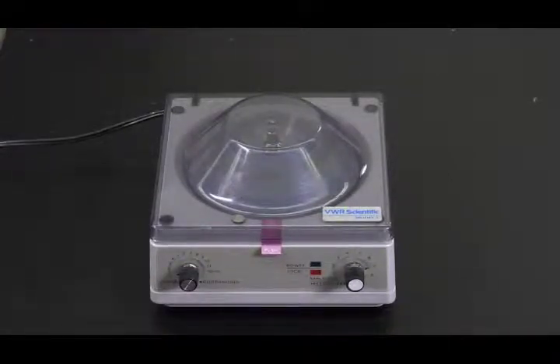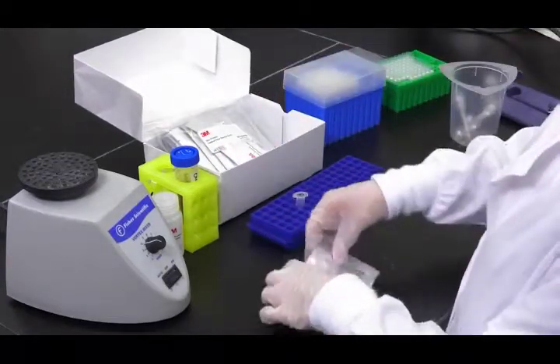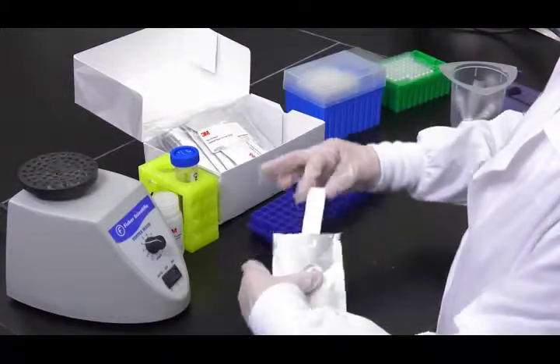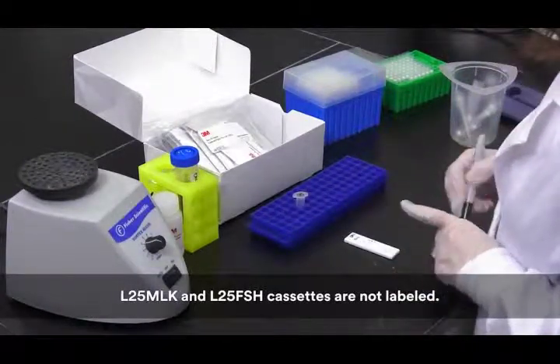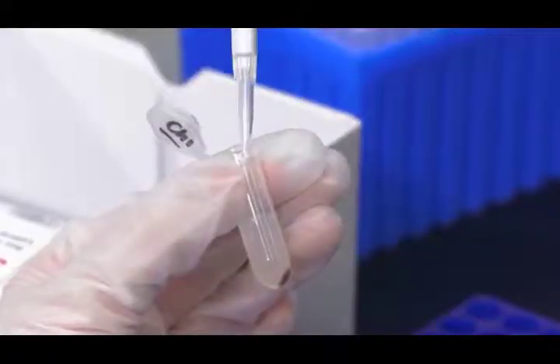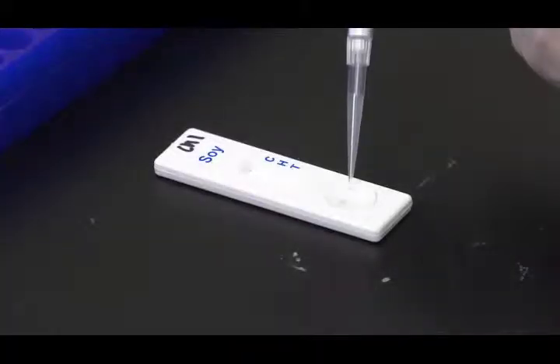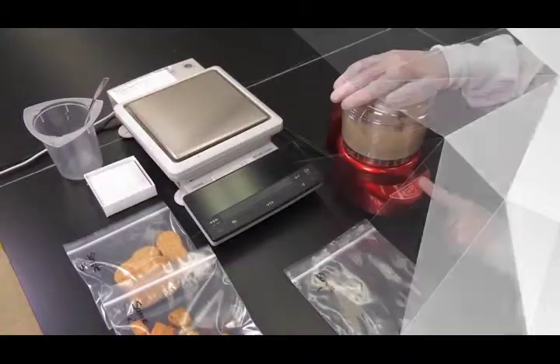The supernatant is the extracted sample. Next, remove one 3M allergen protein lateral flow device from the package and place it on a clean, dry, flat surface. Each cassette is labeled with the specific analyte for easy identification. Label the cassette with the appropriate sample ID. Transfer 100 microliters of the extracted sample from the second tube using a clean pipette or pipette tip, apply it to the sample well on the 3M allergen protein lateral flow device, and start the timer for 11 minutes.